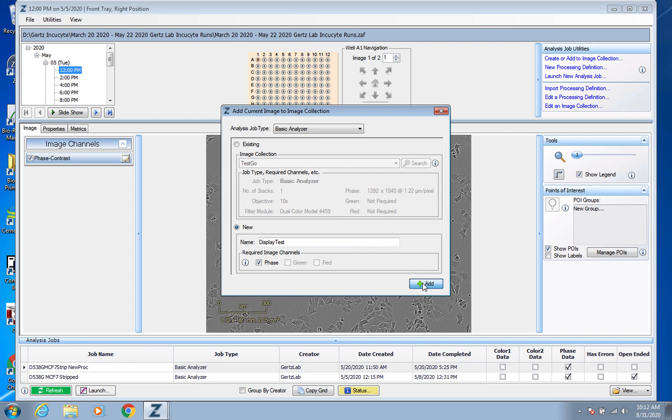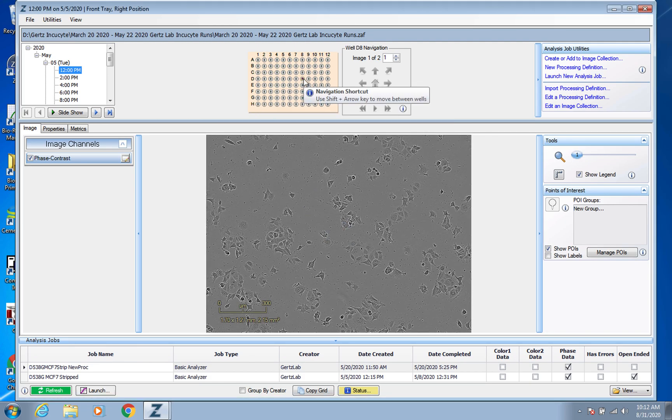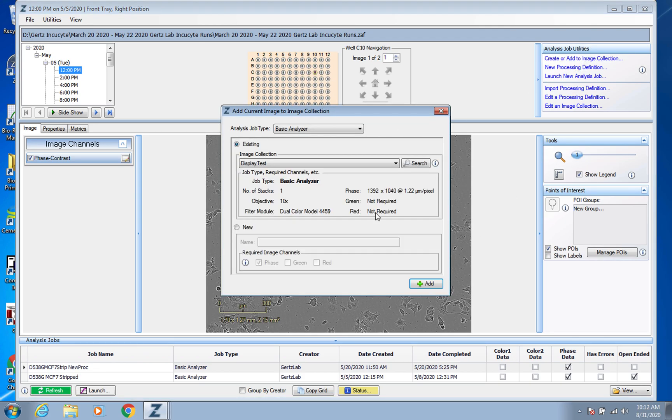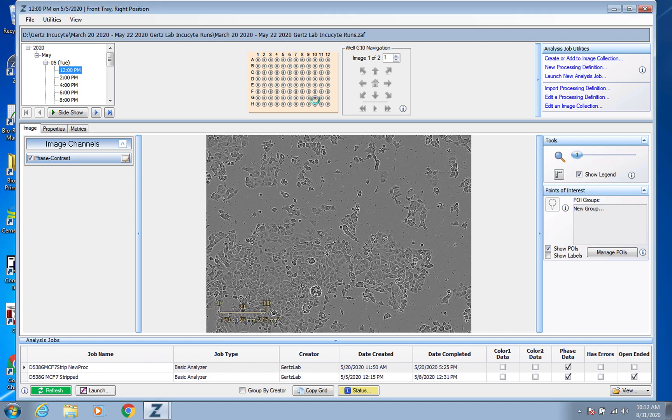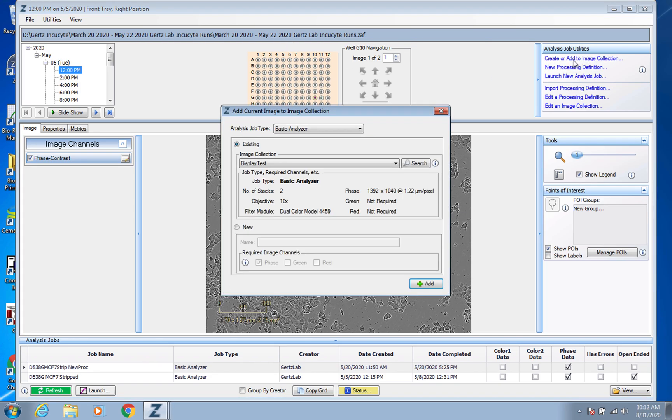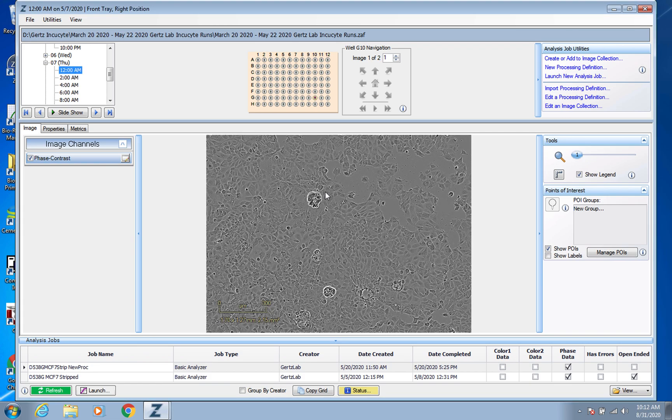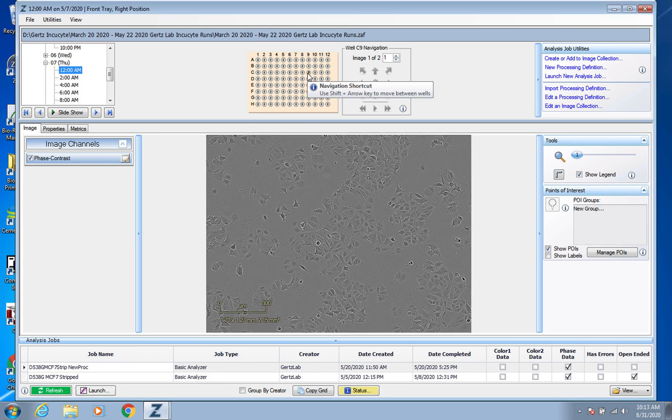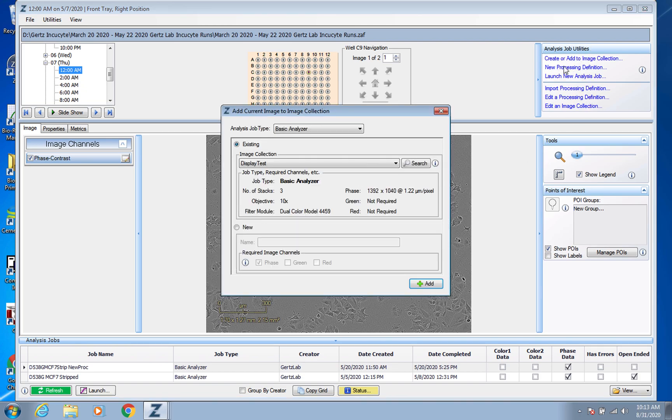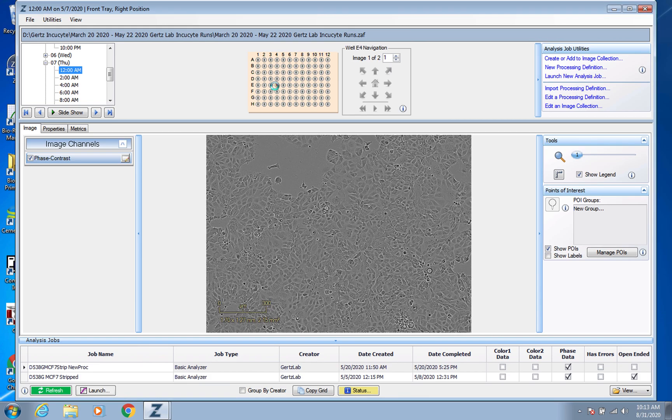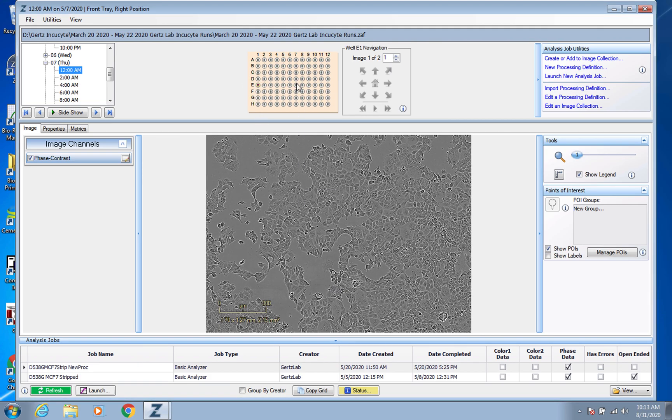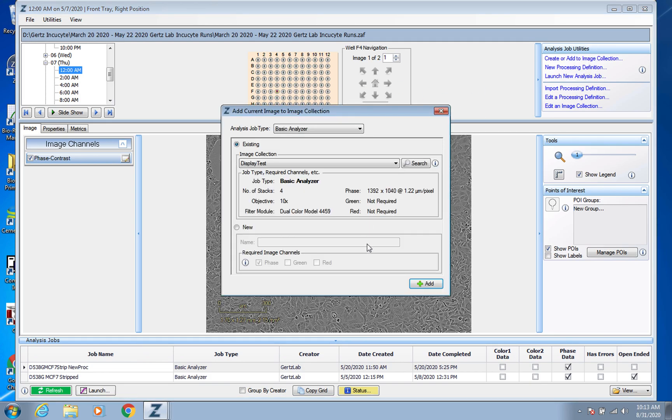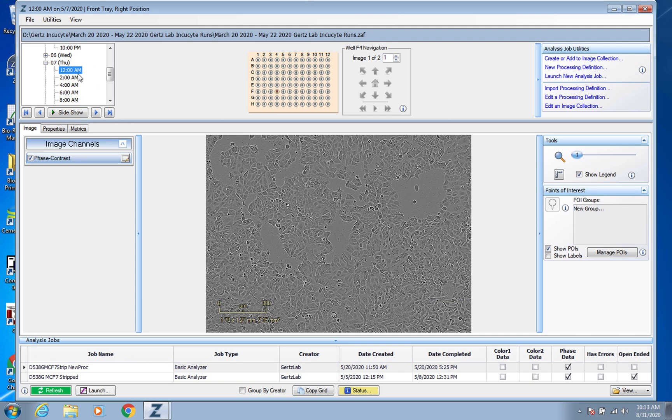And add this image to the collection. And what you want to do is just pick different images that you feel are fairly representative of your cells, and just click around. And each time you'll just, again, go to create or add to image collection. Looks like a good one. How it looks more confluent, you want to pick ones that are different confluencies. So I'm going to kind of pick all over the place. These are some nice cobblestone-y looking ones.